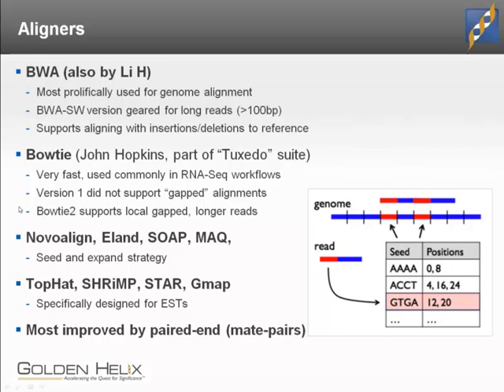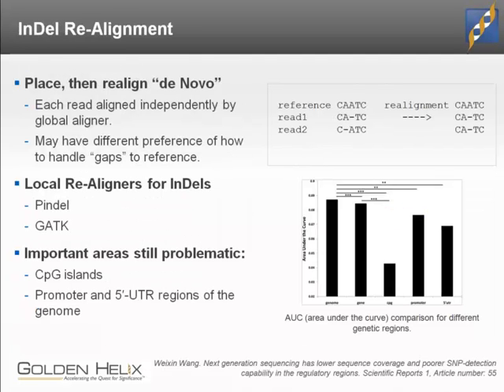And so we have a number of different algorithms that are available that usually are sacrificing a little bit of accuracy in order to have realistic speed and performance. And again, depending on whether you're working with DNA or RNA or have special needs with your DNA, there are different aligners you want to use. And if you want to know more about the best aligner to use, we can talk about it later.